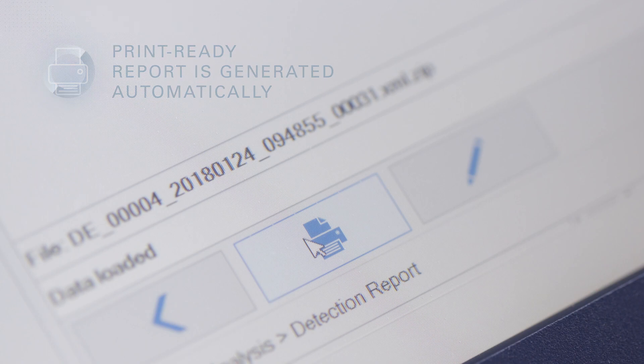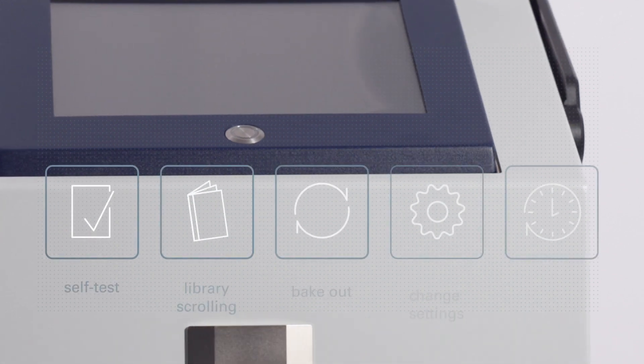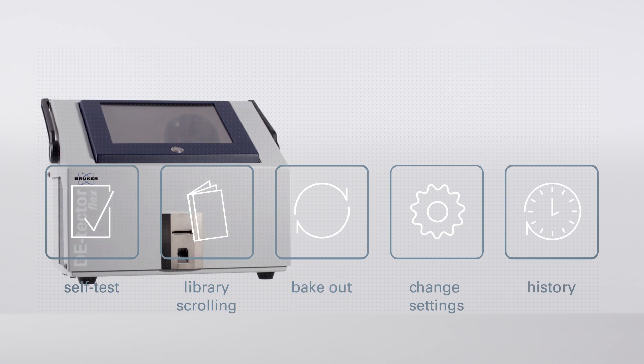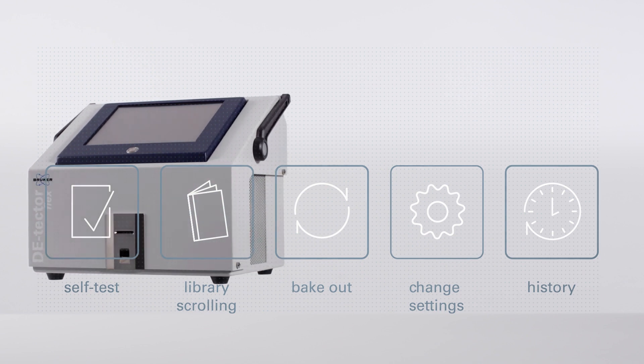The unit includes an integrated thermoprinter. Further functions include library access, selection of methods, bakeout, and tools that enable settings to be changed, as well as a history to view logs and options. Access to these functions is graduated according to user level.